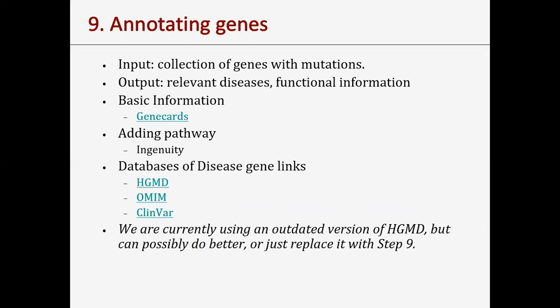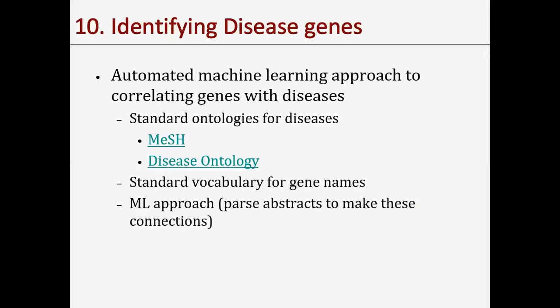And if you are using an automated tool or a web server, the data will basically be fetched from these three databases. Ma'am, are all three databases free of cost? Yes, all are free to use. Just in some databases, you have to use your academic mail ID, but they are free to use. Whatever I show you here is all free to use. There is no restriction. On some databases you can create your account and then use it. Whatever you use will be retained in your account until you delete it.